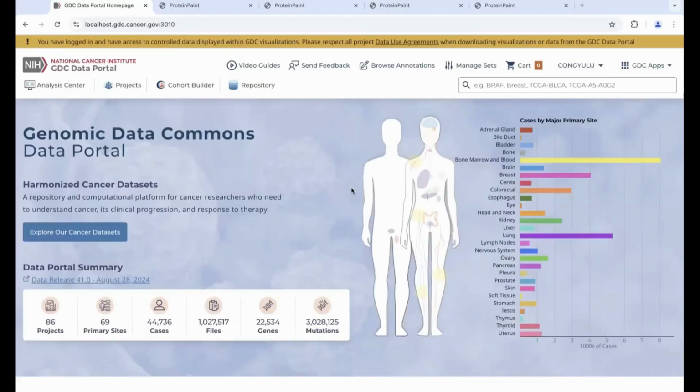Yeah, so I will demonstrate the basic use of the BAM slicing download tool and the sequence read visualization tool. And as Bill just said, because all GDC BAM files are controlled access, in this demonstration, we'll be only using non-GDC open access BAM files.